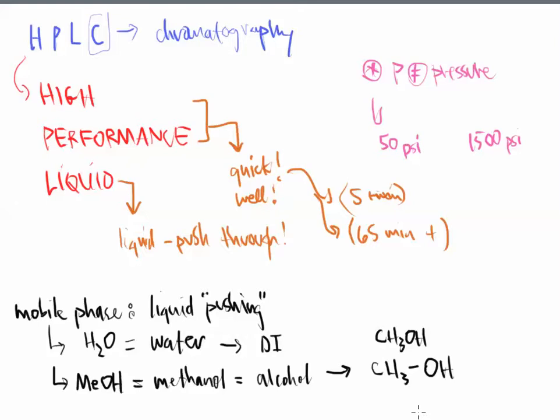And then maybe the methanol can go through your system without getting processed as much. So that's how they treat alcohol poisoning if it's related to methanol. So that's your second mobile phase that's very common for HPLC analysis.